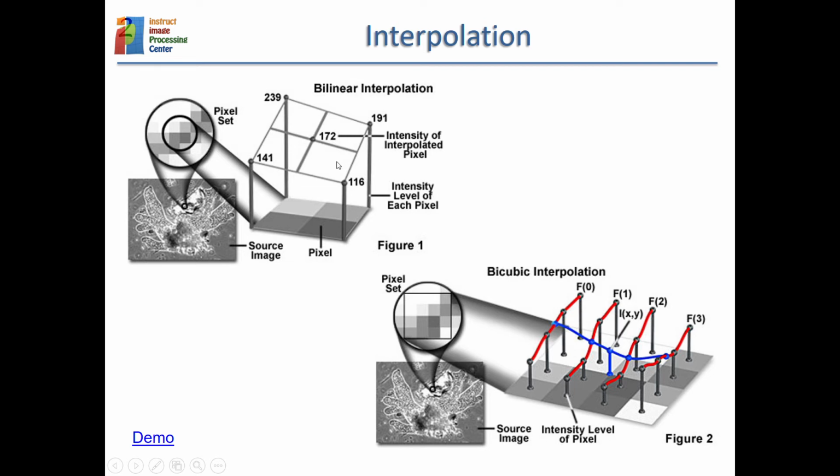And one of the things is that there is a unique plane that goes through all those 4 values. And why restrict to just 4 values around? I could take the 16 values around, and then I would have a better estimate of what the central pixel is.